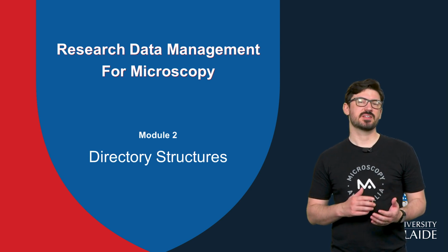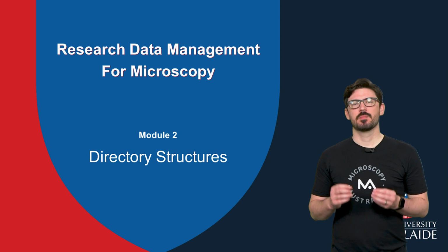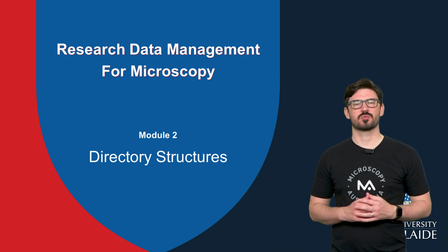By now, you understand how to create meaningful file names for your microscopy data. But where will you store and how will you organize these files? In Module 2, I'm going to talk about directory structures.